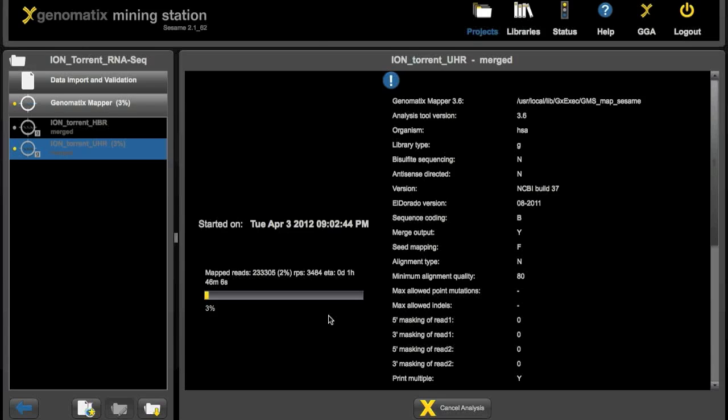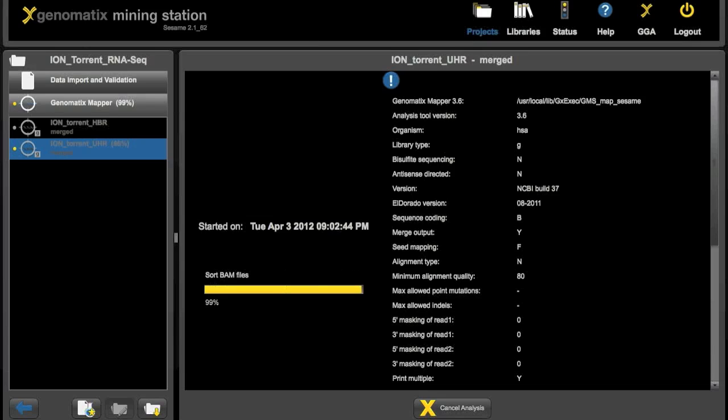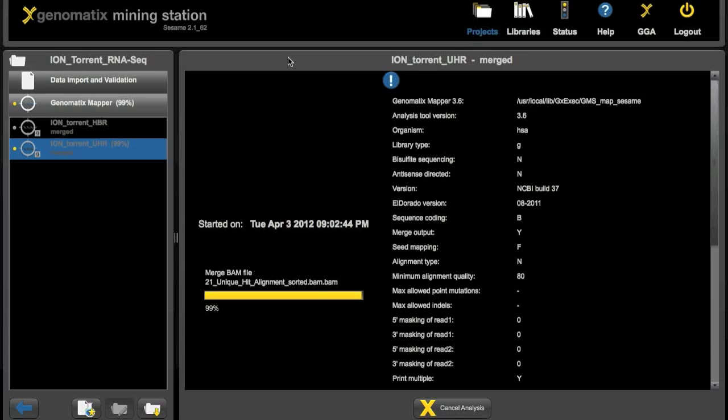For the sake of this movie. So here we are already at 45 percent of the mapping done. And now we are done with the mapping and writing the output files.